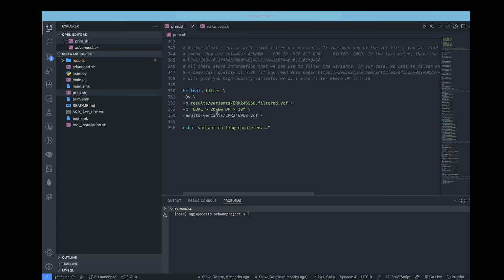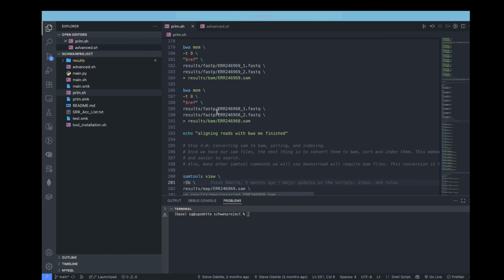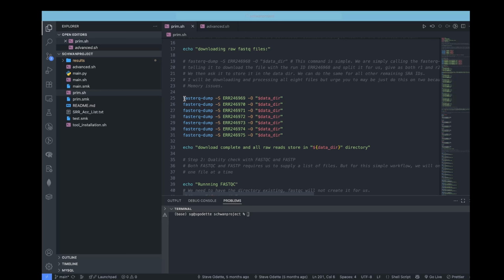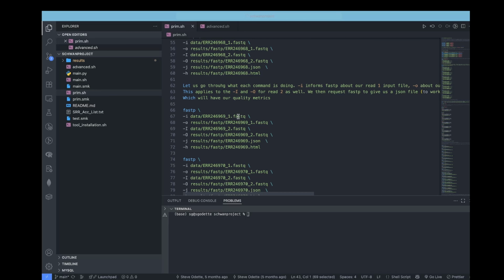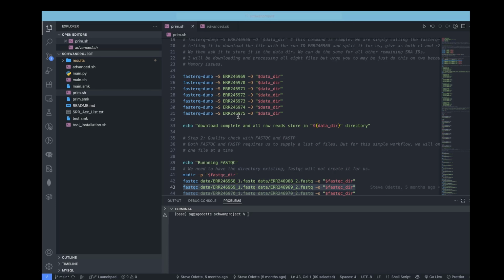But one more thing I want to highlight is this script that we wrote here. As you can see from this script, it's a very long script. It downloads about 7 FASTQ files and runs the bioinformatics functionalities of the analysis for each single FASTQ file. Now, it does so in separate lines. For example, you can see here that we are working with fasterq-dump to process this file, then writing another fasterq-dump for the second file, like so. This is a little bit chaotic because imagine you have almost 100 samples, which is typically what you may be working with.